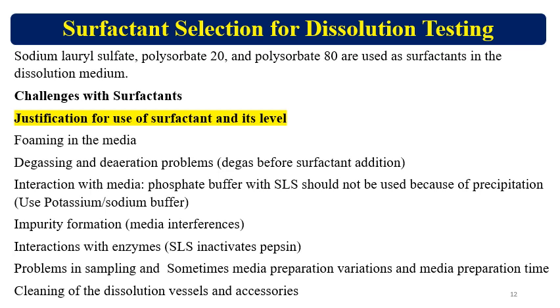Impurity formation or media interference is also a reason. Sometimes the surfactant interacts with the drug molecule itself and it may lead to precipitation and impurity formation. Interaction with the enzymes. SLS generally inactivates the pepsin. It is given in the literature.